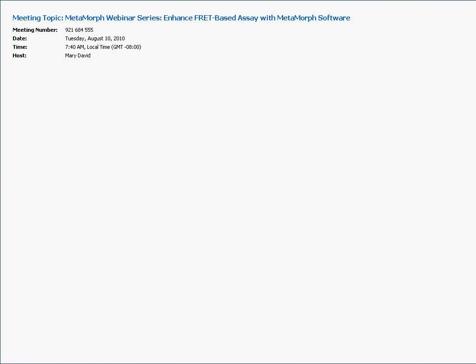Okay. So we can see we're dealing with a 13, a 9, 11, 12, a 7, a 5%. So our average is right around 9% efficiency. So again, that's why it's important to utilize background subtraction, because otherwise it can potentially give you some false positives.